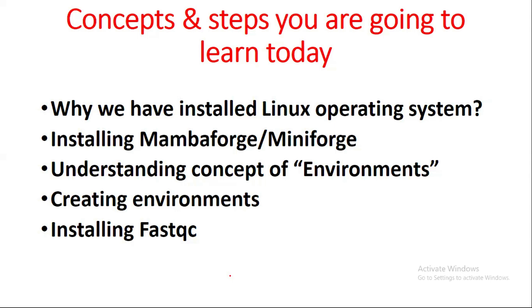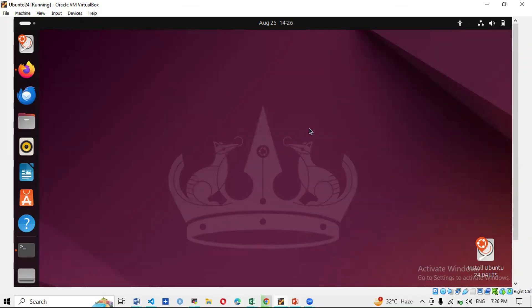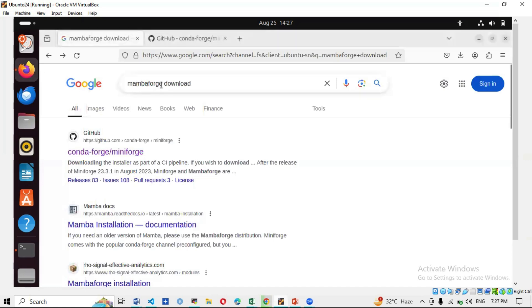Let's start the practical. First we'll install Mambaforge/Miniforge, then deal with environments and creating environments. This is the interface of our Linux operating system. To begin the installation of Mambaforge/Miniforge — these are softwares produced by the conda/miniconda project. After installing this, we install tools inside Mamba and then proceed with data analysis.